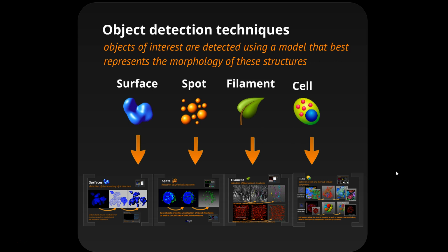What's the upper limit to the number of spots you can track? We actually haven't got there. We thought this 2 terabyte data set was a pretty good test of the spot detection, but it really ultimately depends on your computer specifications, as to how much RAM, how much hard drive space, what your GPU is. All of those things can really impact this. So we really don't know what that upper limit would be. But if anyone wants to do some benchmarking, that would be awesome.